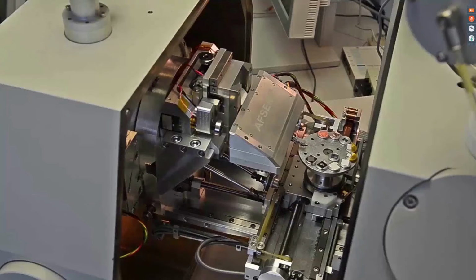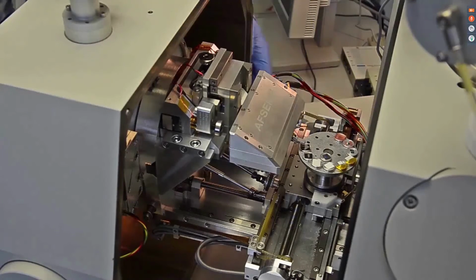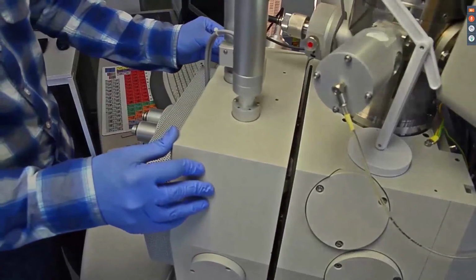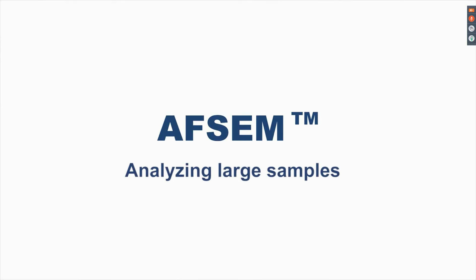For that, you can rotate or move the SEM stage in X and Y direction freely underneath the AFSEM, as the SEM sample stage movement is decoupled from the AFSEM movement in X and Y direction. This allows you to image every sample that practically fits your SEM.